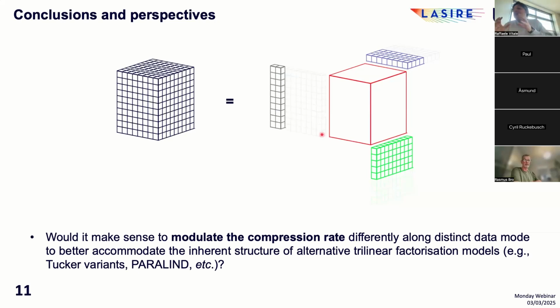You would just be a bit more robust because, in a real case study, you might have outliers or noise that generate observations that cannot be described as linear combinations of pure component spectra. So you will definitely select them. But if you play with sequential convex peeling, you can robustify the whole procedure in that sense.